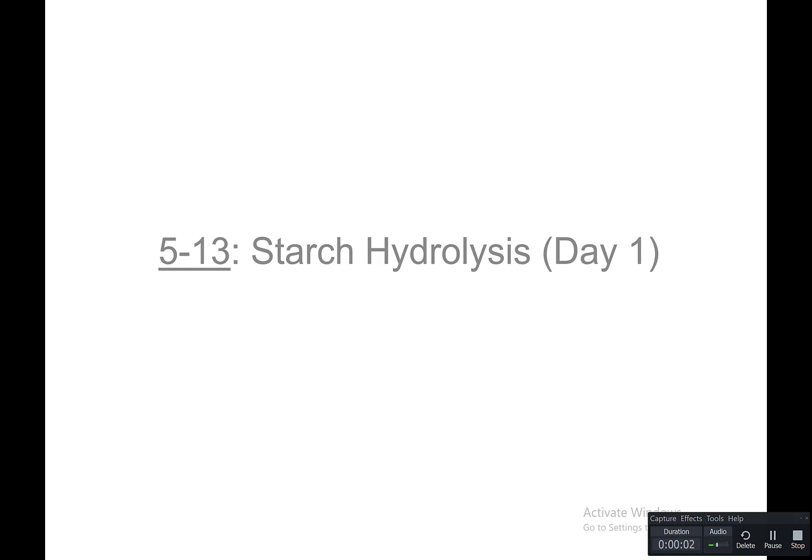In this video, we're going to look at starch hydrolysis, and this is activity 5-13. We're going to start with day 1, which is the setup for this test.